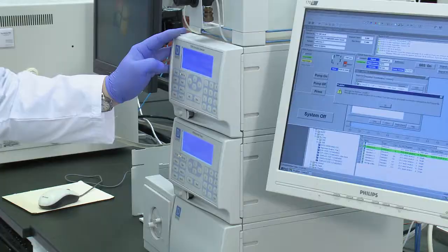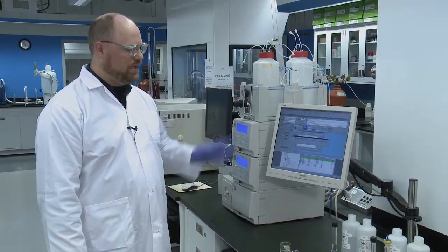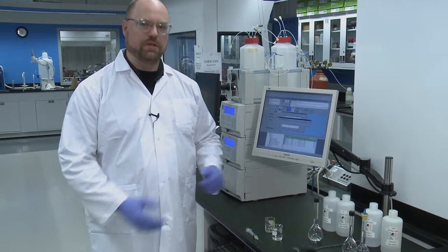So when you come to the lab, you'll find the instrument which consists of a detector, a pump, an injection port, and the computer that runs everything.